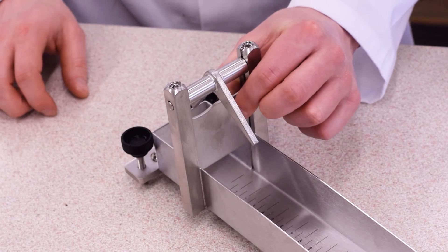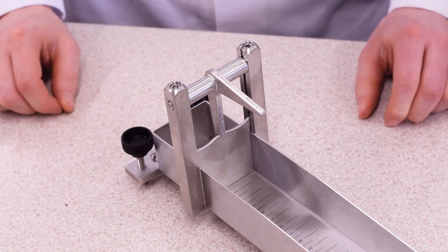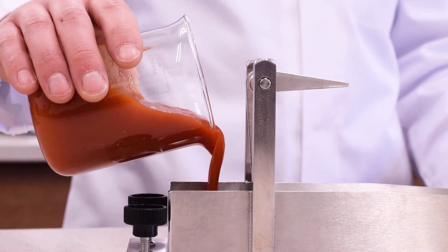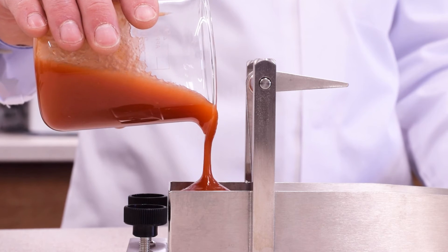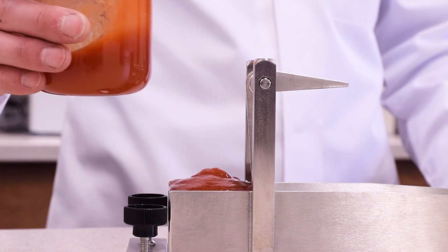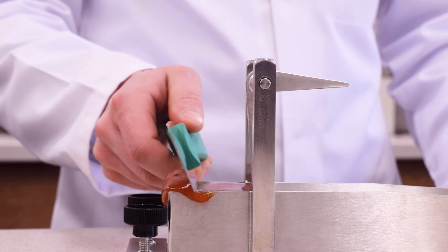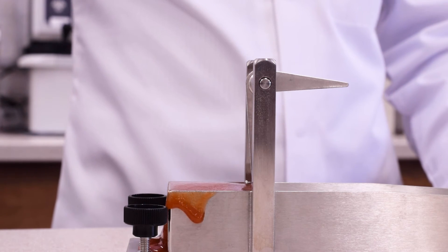Ensure the gate is down and locked. Then pour the sample into the reservoir. Remove any surplus sample using a knife or similar straight edge tool. We're now ready to run the test with our sample.